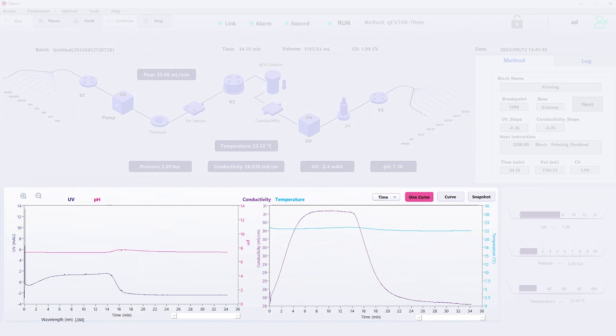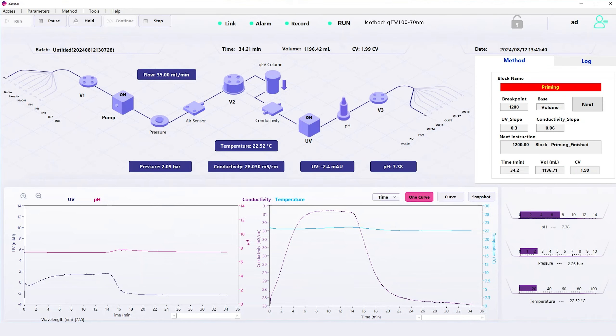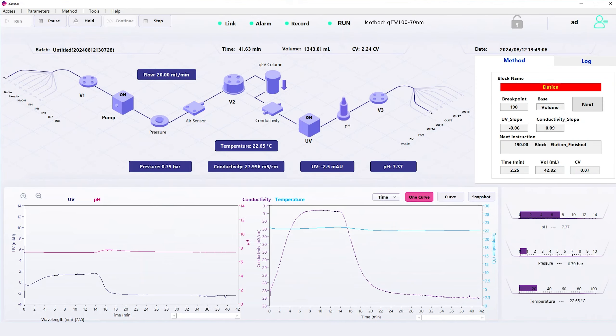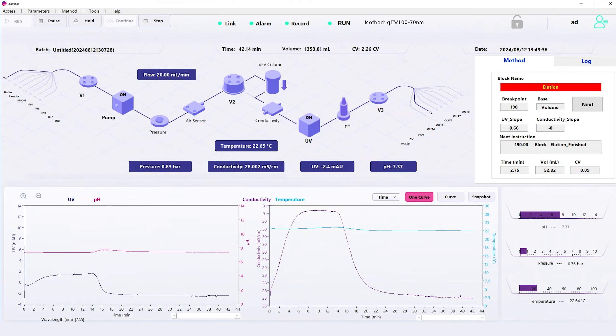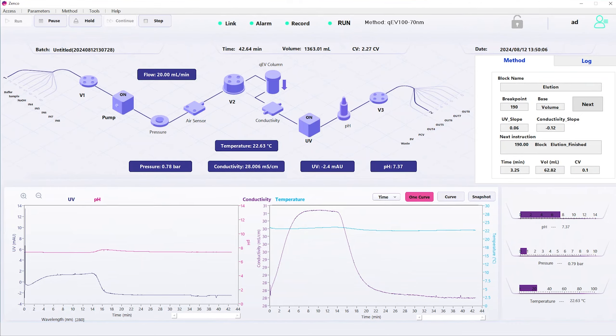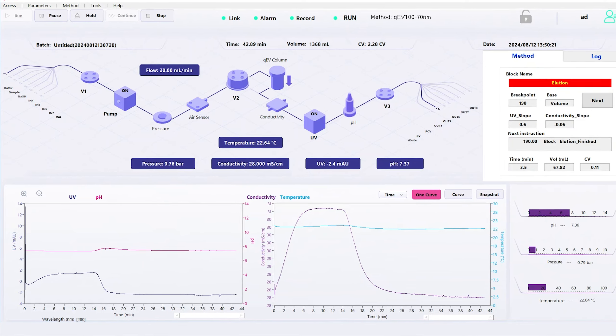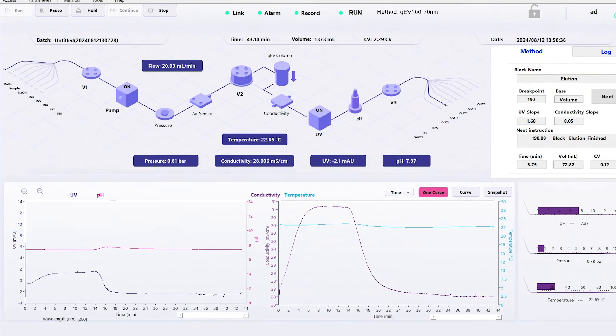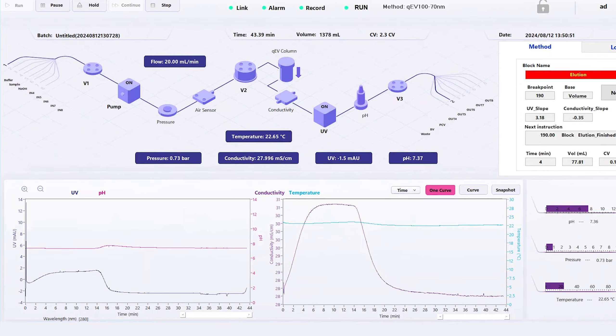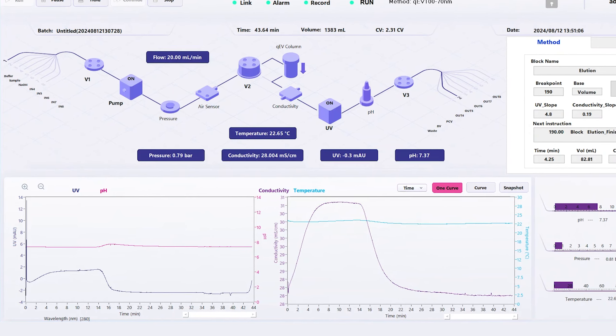We are now at the point where we have already primed the column, and we're now eluting the sample. You can see the UV reading rise, indicating the start of the peak in particles.